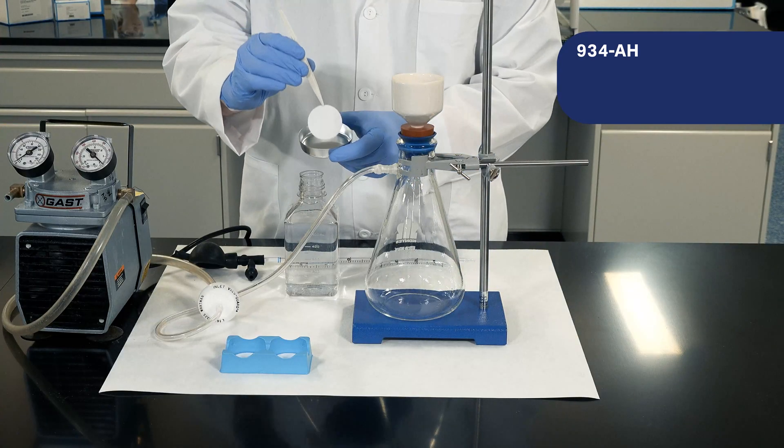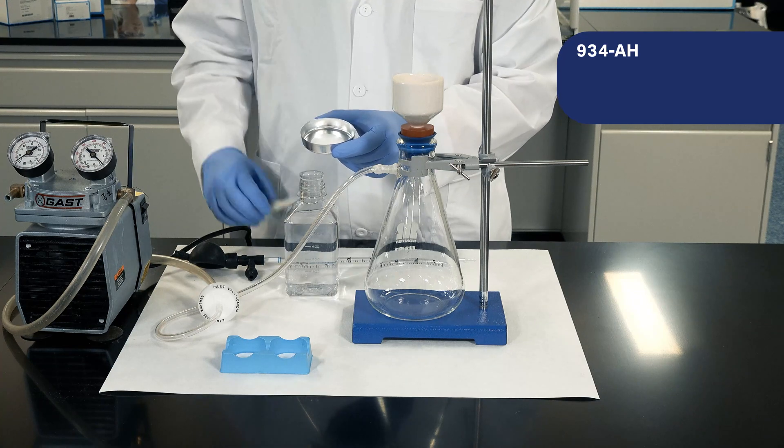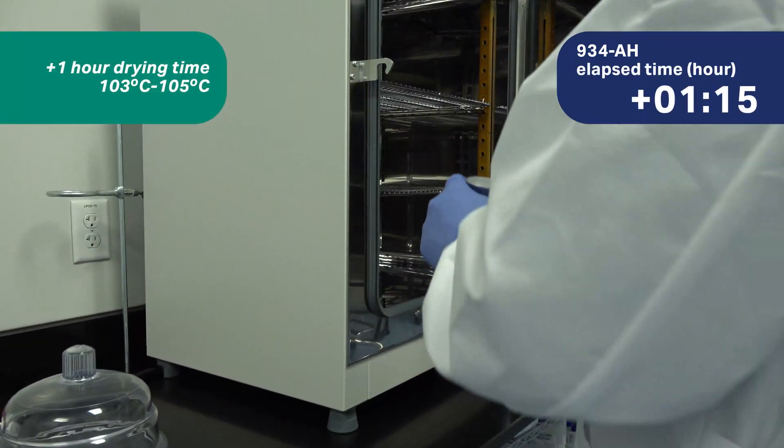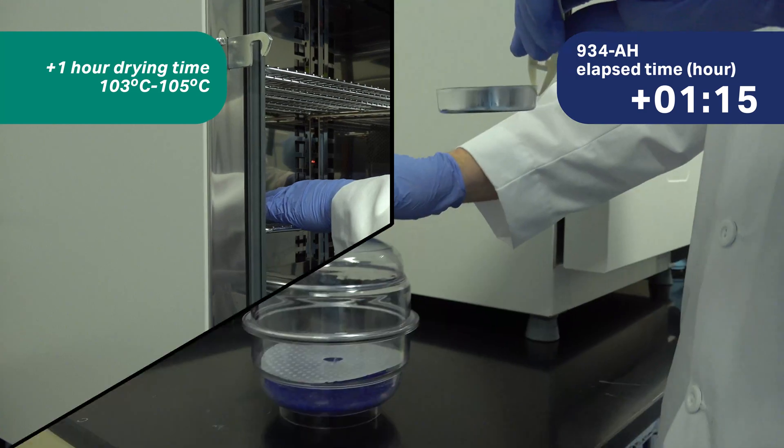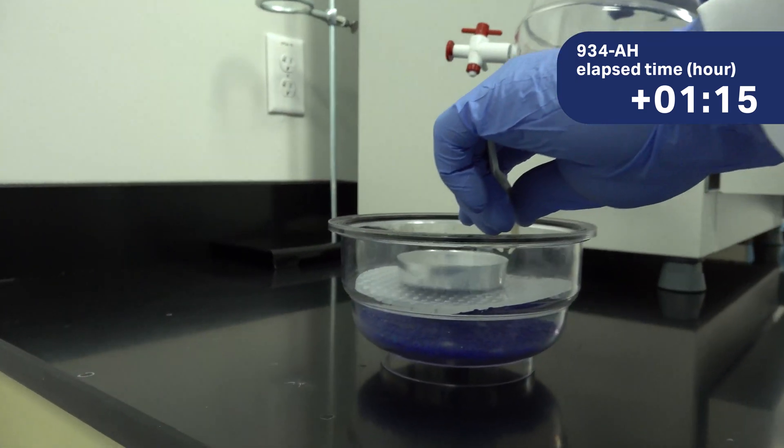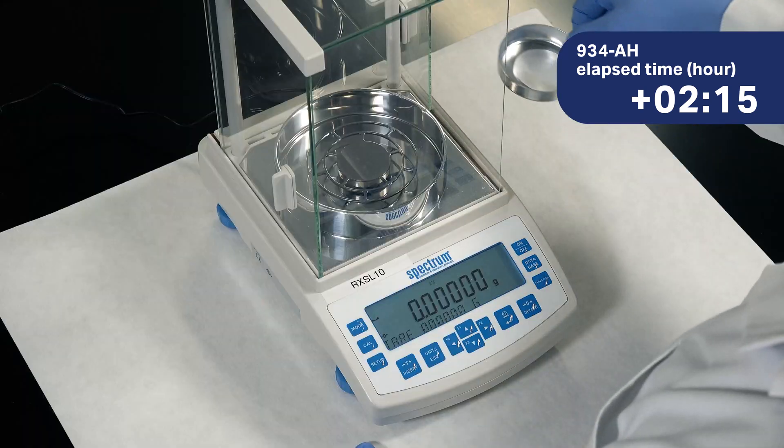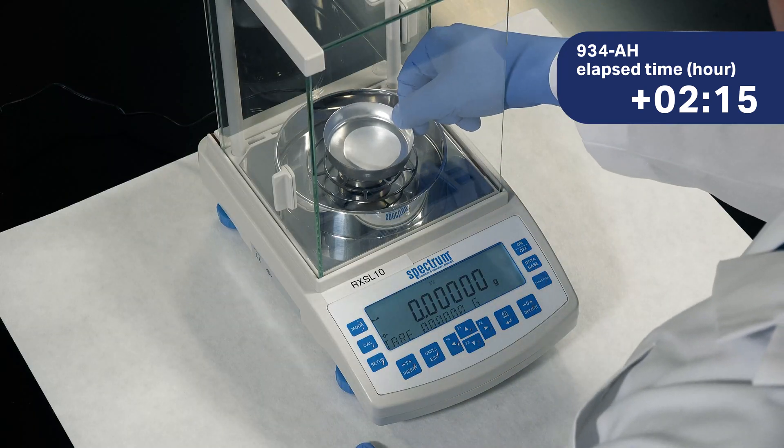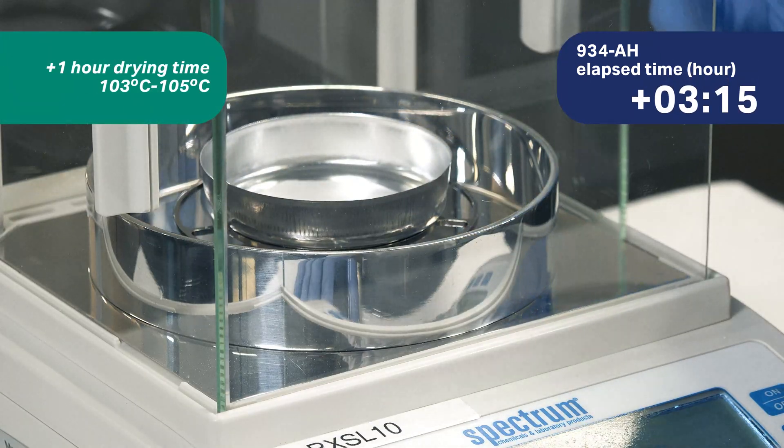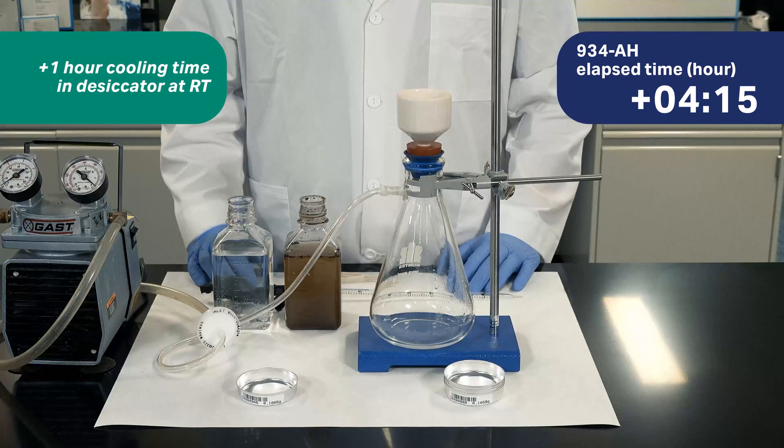Next, place the filter in a crucible and dry it in a laboratory oven for at least one hour. Carefully remove the filter from the oven and cool it in a desiccator. Then, weigh the filter on an analytical balance. The drying and weighing process is then repeated.